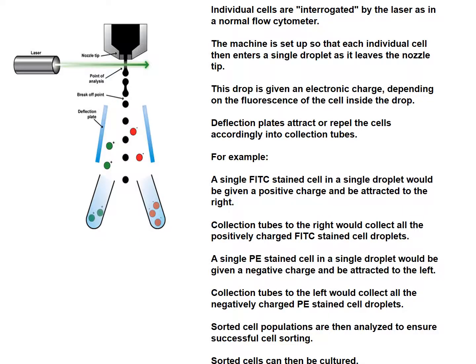Okay, so this is maybe another way to look at it. Here's your laser, here's the nozzle tip, you're shaking into drops. And so individual cells are interrogated by the lasers that are coming through.